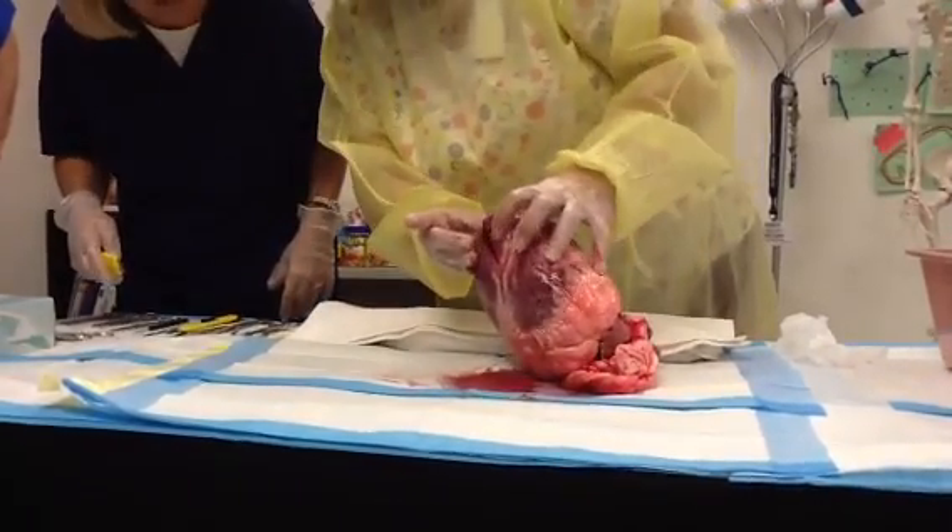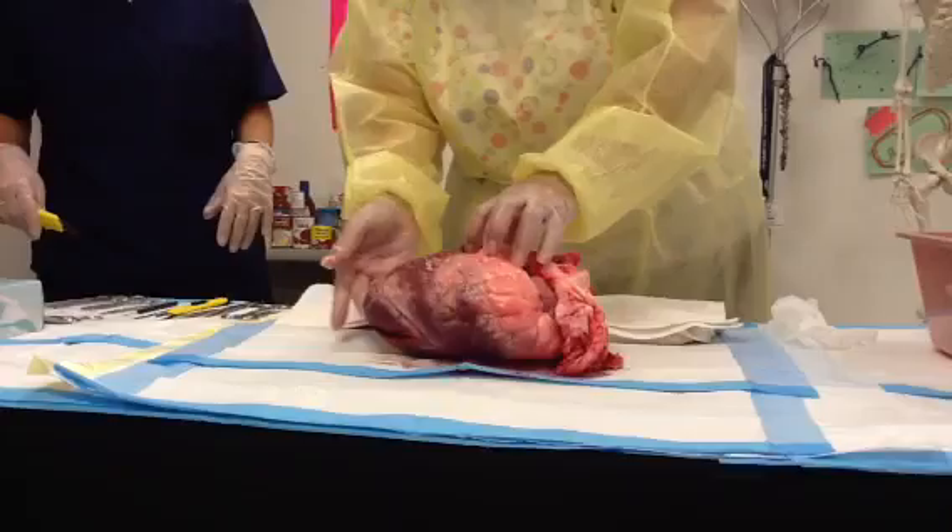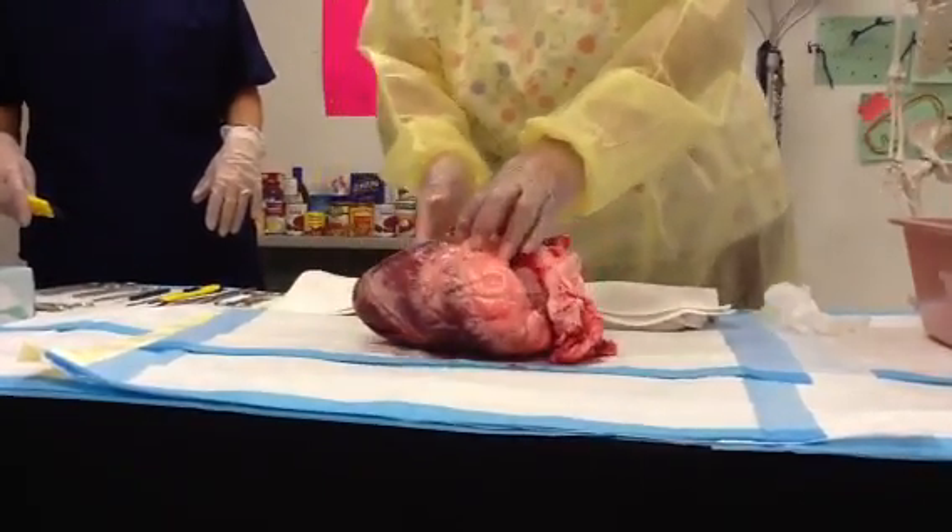Looks like he kind of started here. You might be able to use this. Just start right there and do a bilateral incision all the way around.